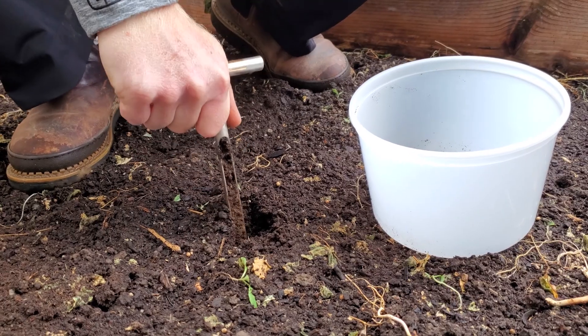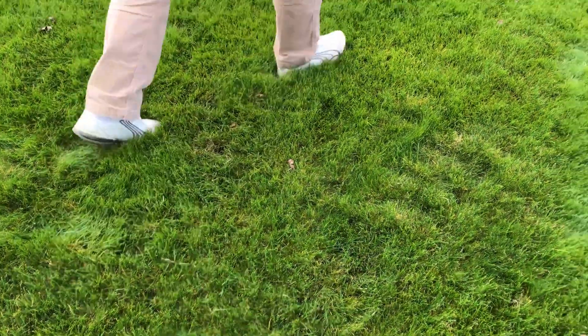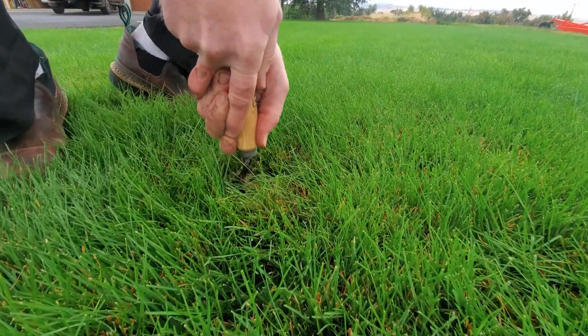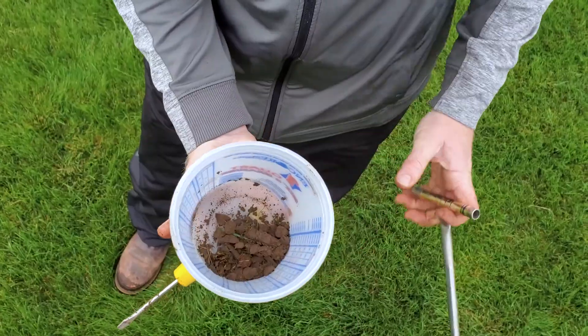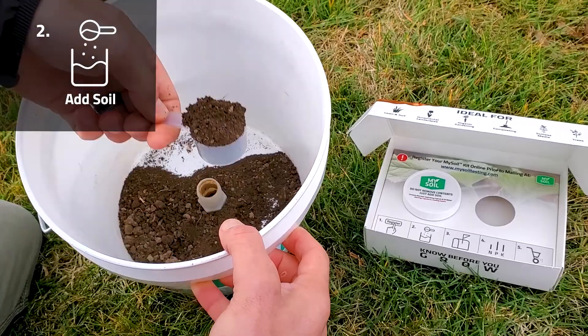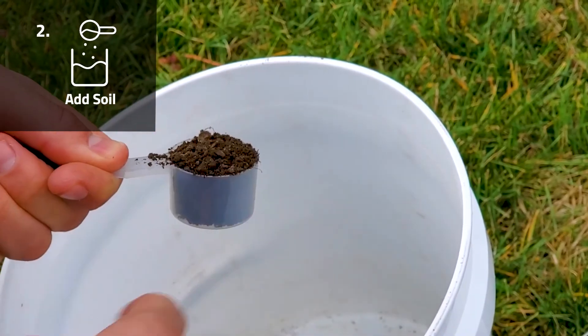To perform a soil test, determine the area to be tested. We recommend pulling soil from five to seven different spots to a depth of six inches. Use a large bag or bucket to collect and mix the subsamples. Then, using the provided scoop, add one full scoop of the composited soil to your sample jar.